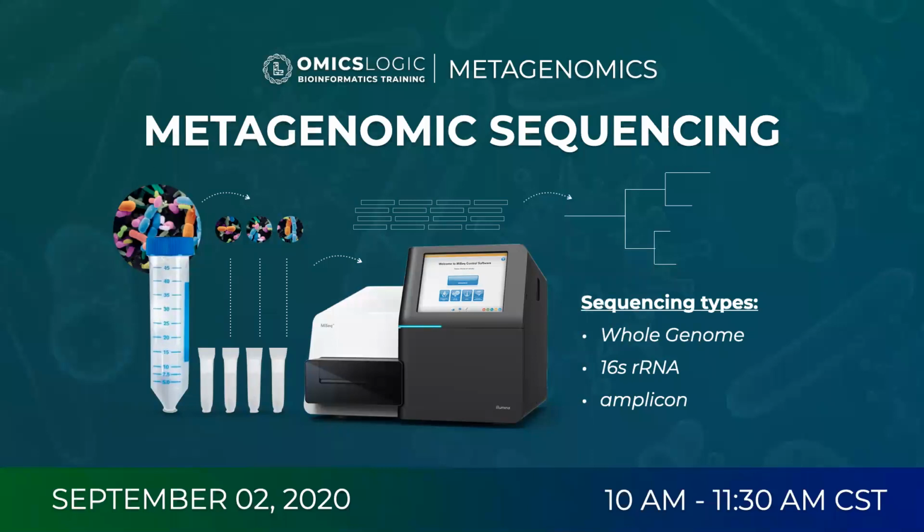Specifically when we talk about metagenomics as an approach, we want to analyze microbial DNA from environmental communities. So we want to preserve the composition or the condition that a particular member of that community is in. Metagenomics analysis tools enable us to study populations that consist of both culturable and typically unculturable, or a lot of unknown microbes.